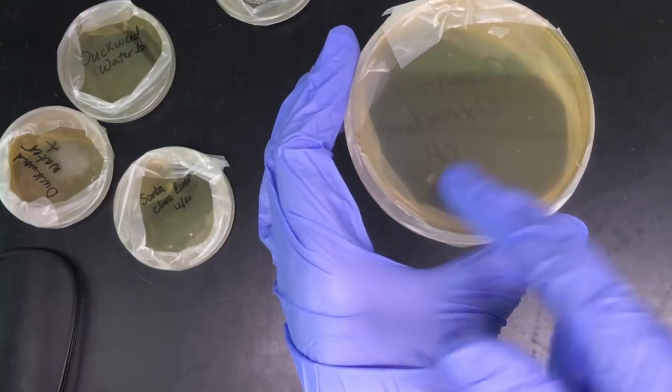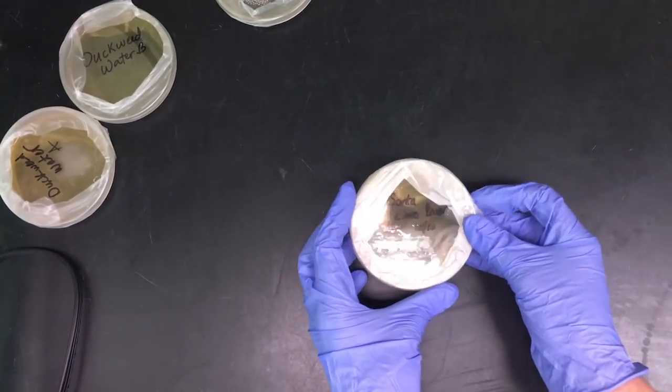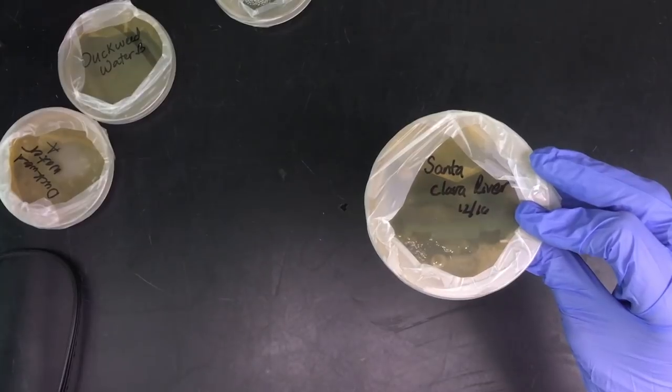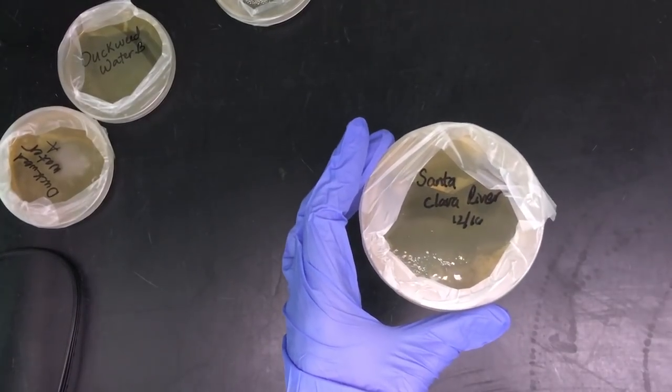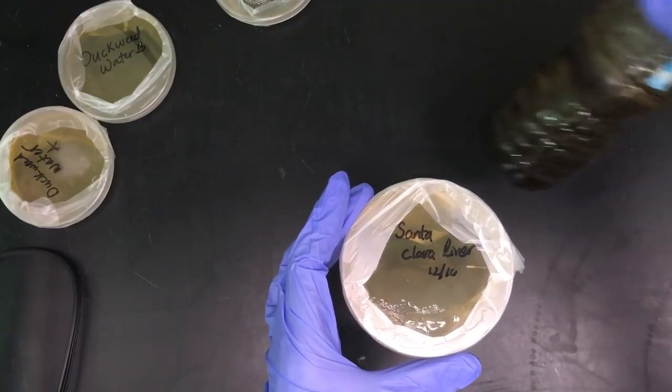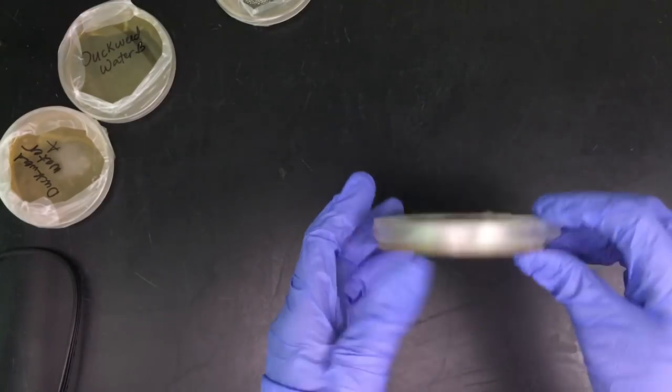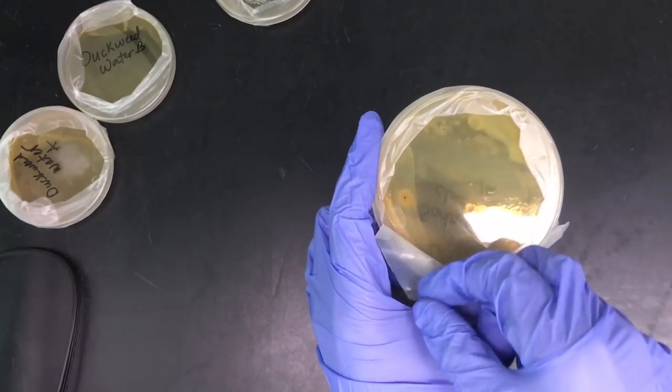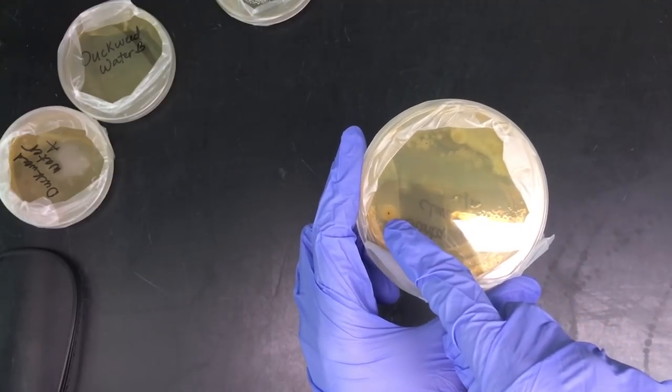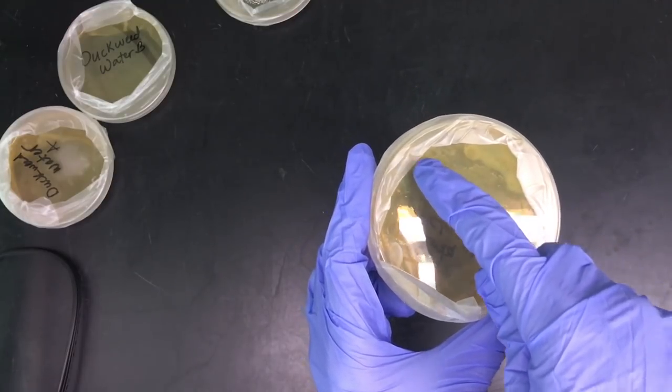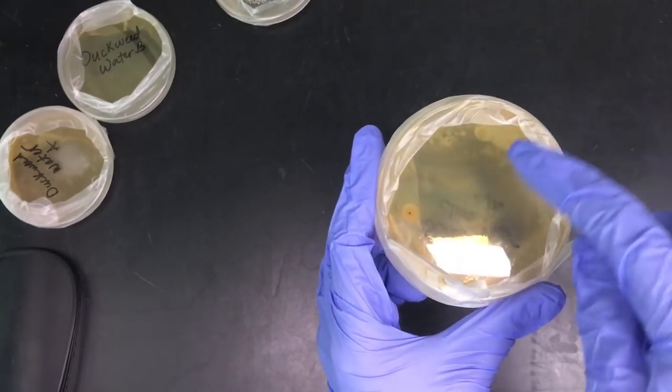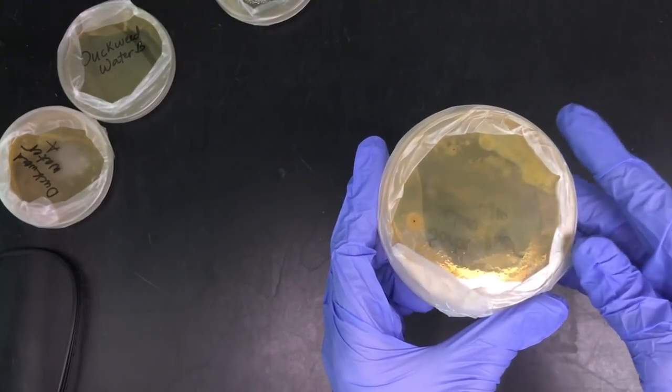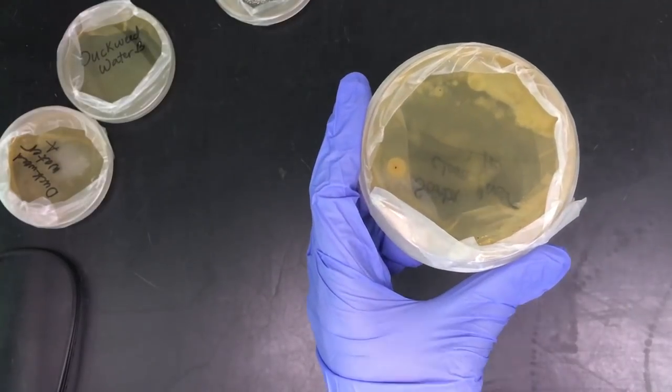This is another sample from the Santa Clara River taken when the water was extremely turbid, so very very turbid water. This was the water source, almost black, and that was after rain. And this one is definitely positive. You can see there's a lot of colonies growing and some of them are coliform. So that's a definite coliform bacteria and then that and then that and then some smaller ones. So it looks to me like we have about five colonies of fecal coliform. It means that as that water was washed down into the river it picked up some feces along the way.